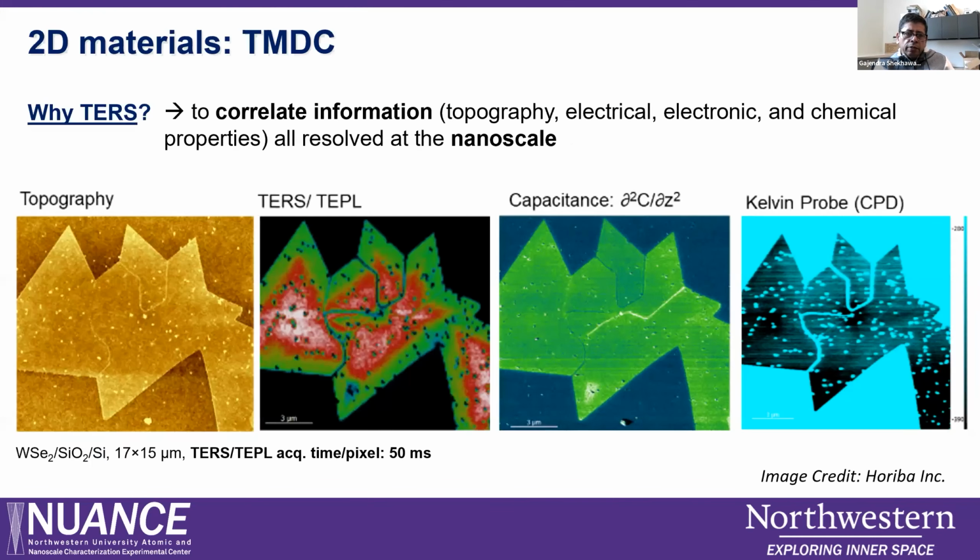Some of the other applications that I have not included, but you can also do, are semiconductor nanostructures, stress profiles, strain variations in those materials. Some groups have seen viruses; a single virus you can detect with this Raman spectroscopy.